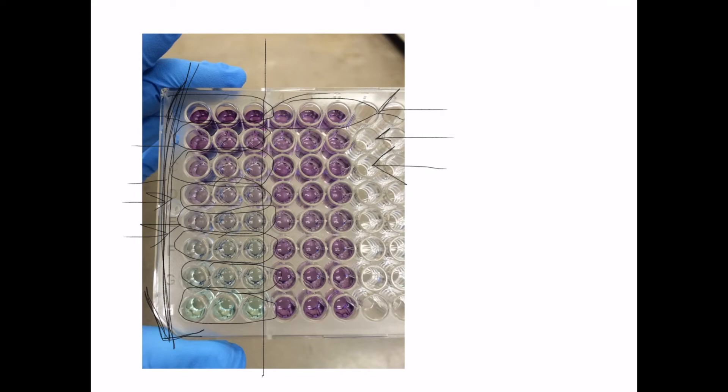And when making these dilutions, you'll just use the same formula as always, which is concentration one volume one equals concentration two volume two. You'll fill in the known three: your initial concentration, then the final concentration you want and the final volume you want to calculate the initial volume that you will use in the dilution. And you'll add water or whatever the solvent is to bring it up to that final volume.